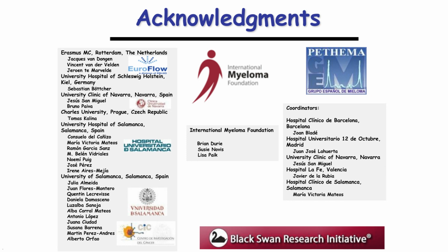So we may have some other informative markers to use in this case. Most of the time, the abnormal plasma cells do not show a unique or only two abnormalities, but more than that. So I'm sure that we will have sufficient information in the whole combination to be able to detect the abnormal plasma cells in these cases.